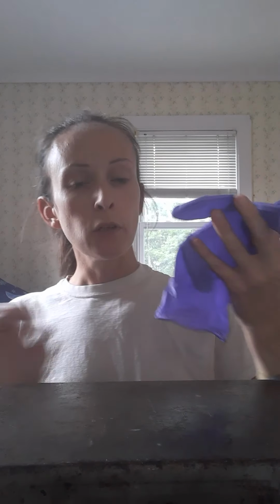So before I get started, I always prepare myself. I didn't have my gloves on first when I started this, but you always put your gloves on, lab coat, goggles, hair pulled back, make sure that everything is out of the way, from getting anything on yourself or anything in your environment.